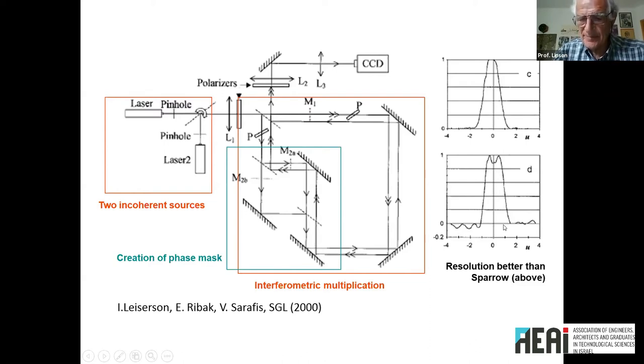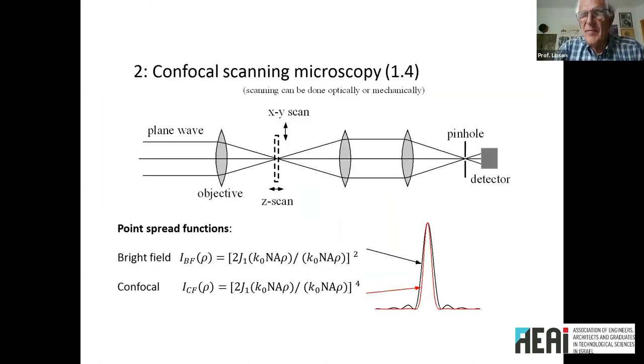So, okay, that's a system which you can use, and it does have the advantage of not affecting the sample. The sample is untouched, and so it is useful, but as I said, it gives you 2 to 3 improvements in the resolution.